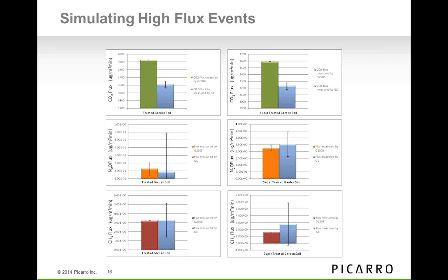And for CO2, there's actually a slight discrepancy in the two measurements. It's about a 9% error between them, and I'm currently trying to figure out what happened there, and if perhaps my calibration was off for CO2 and it goes out of linearity at some point, but I'm currently working on that as a new project.